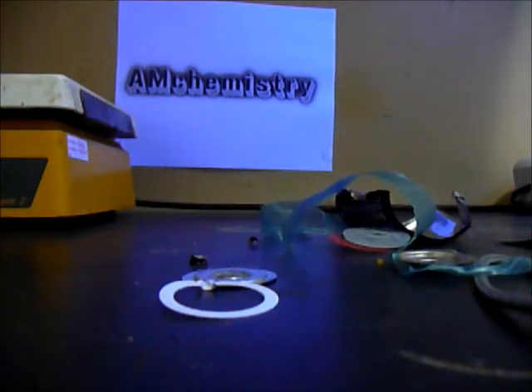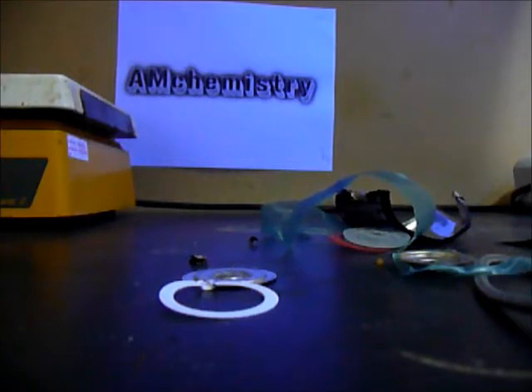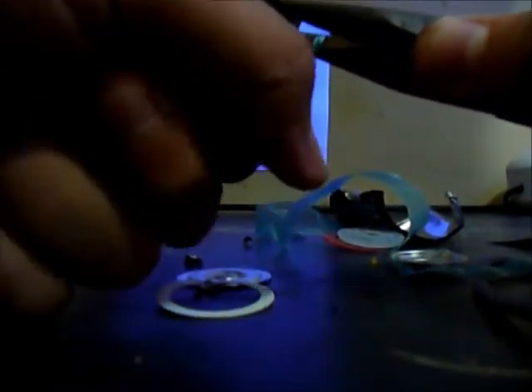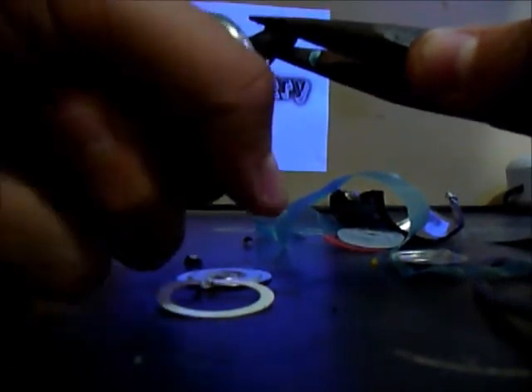This thing is really hard. So don't expect it to come very easy. I think it's glued. Just with this, get it, and go like this, clockwise, and it'll be coming out, you see?